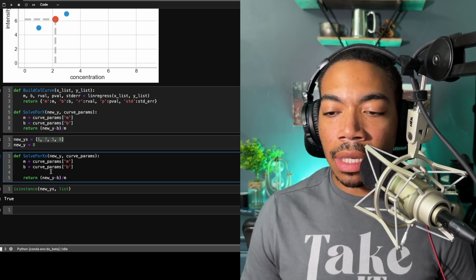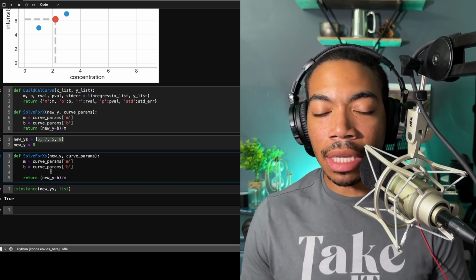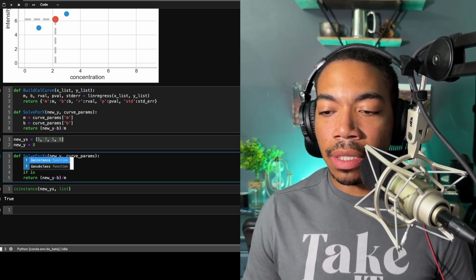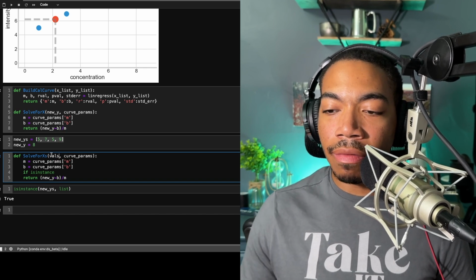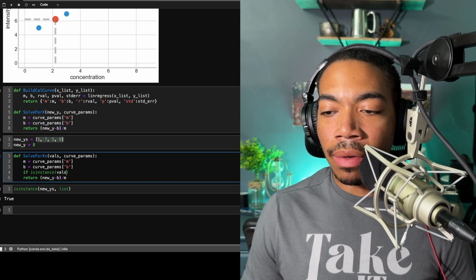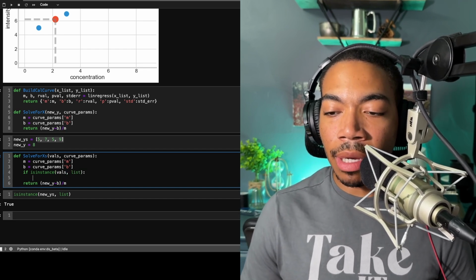And so in this case, let us first evaluate the instance of the data type and then make an assessment. So let's do that. So if isinstance, and instead of new Y, let's call it vals. And we're going to say if isinstance vals is a list, then we're going to do something special.